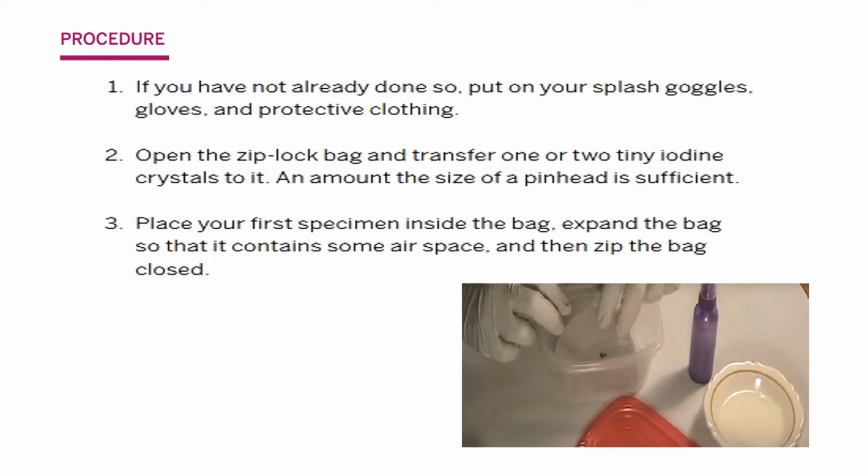We can see this one. See that in the box there are iodine crystals. That much iodine is enough. Place your first specimen inside the bag, expand the bag so that it contains some air space, and then zip the bag closed. So what you have to do is keep the sheet or the paper that contains the fingerprints inside this bag, and close it.